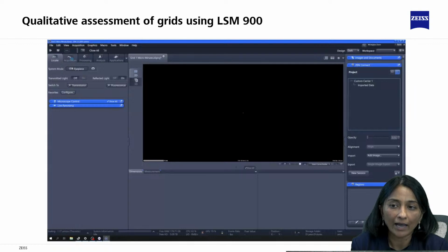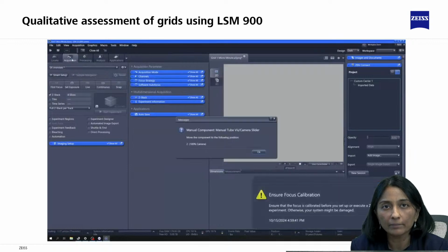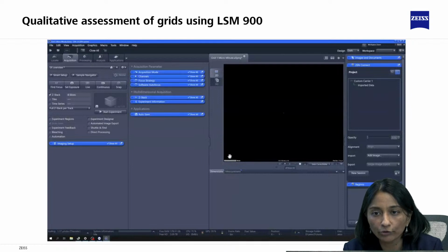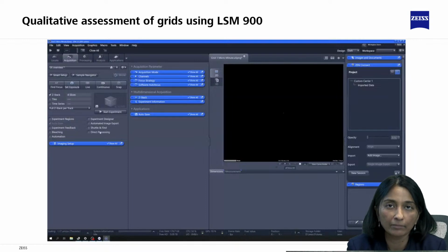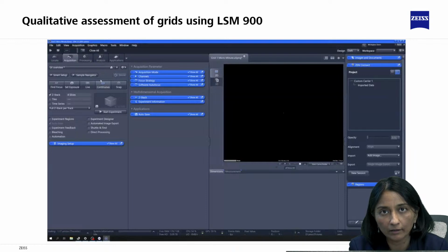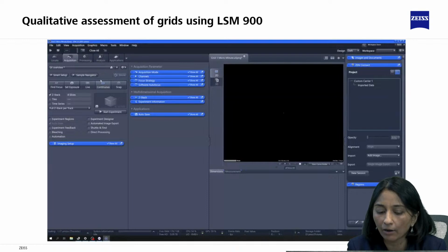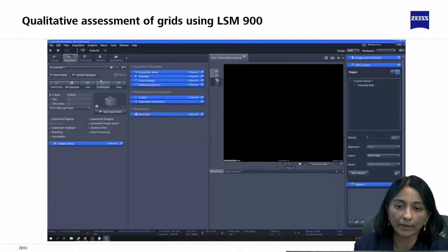Then you click on the acquisition tab on Zen, and under that tab, you have all your pre-built experiments. For example, you can have an experiment for the 5x overview, which has the channels populated for reflection and transmission typically, and then a 10x experiment, which will give you an idea of the fluorescence signal coming from the sample, how good is the signal, how confluent are my cells, and so forth. So that's the first step when you start imaging on the light microscope.